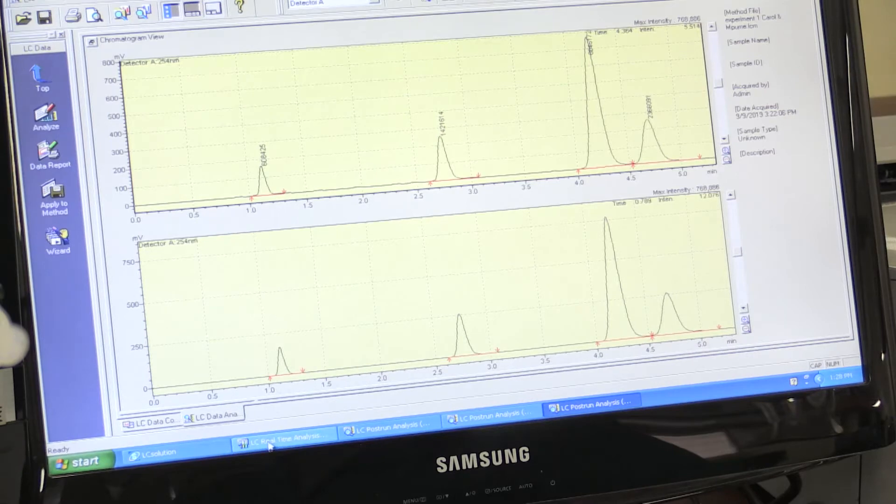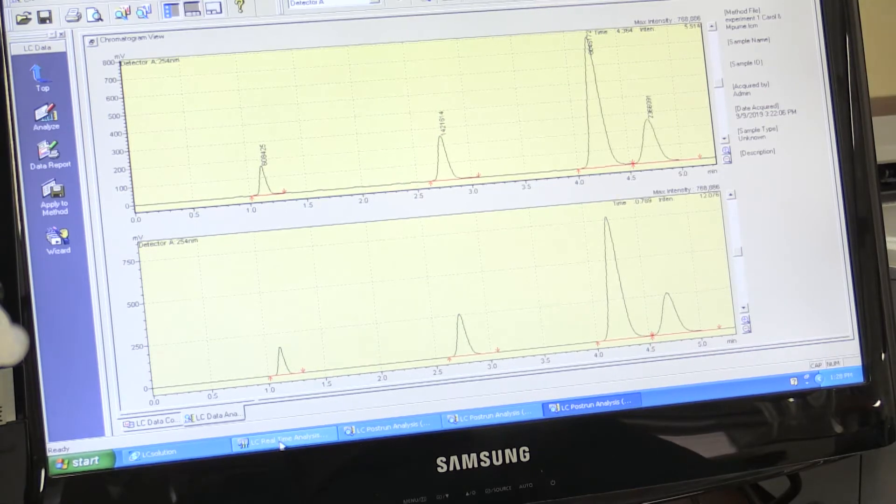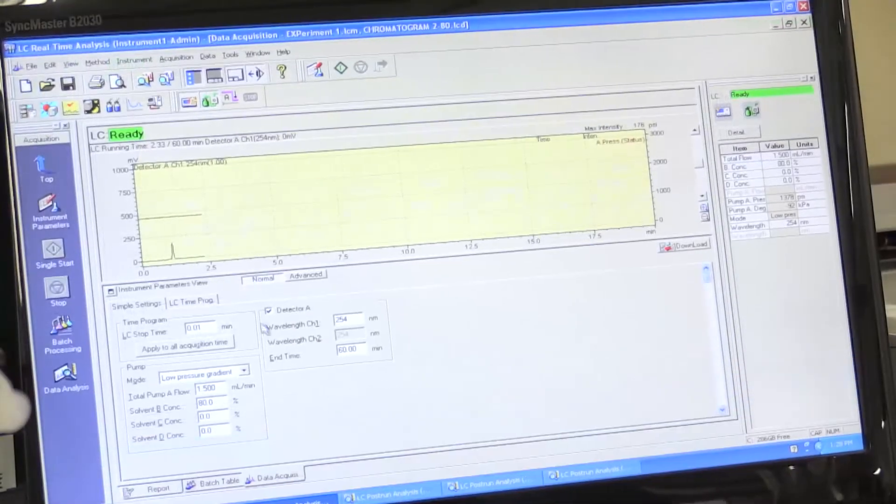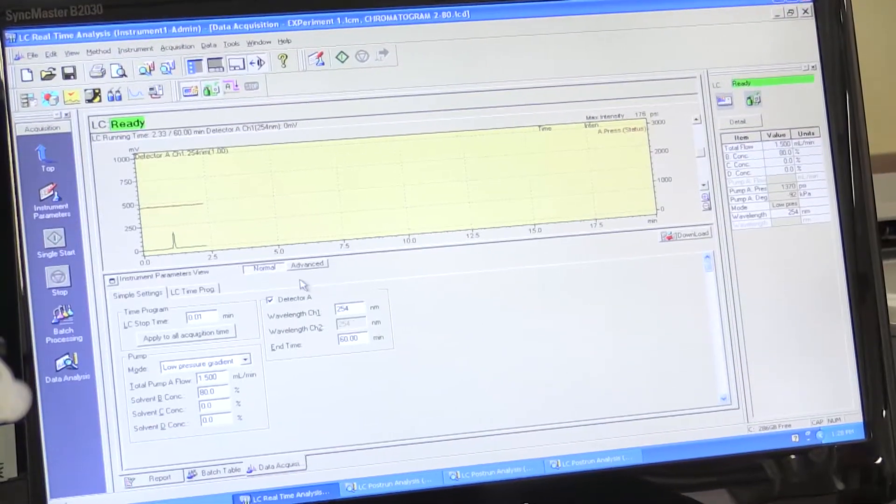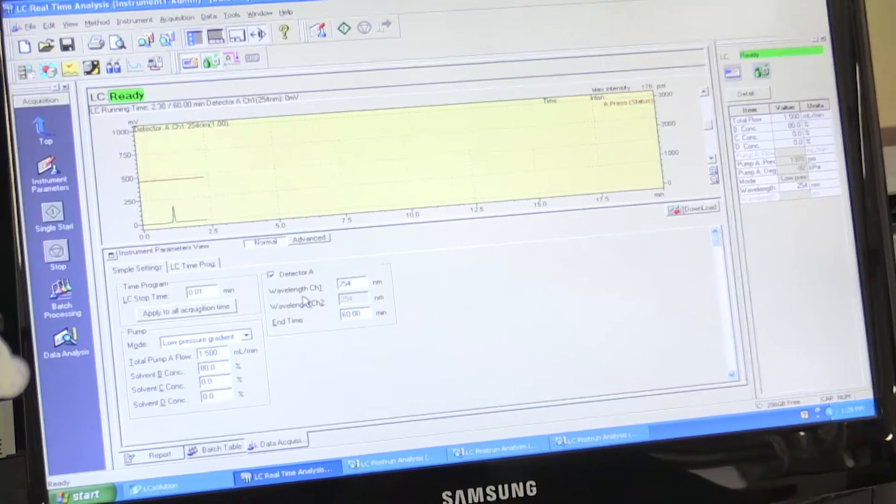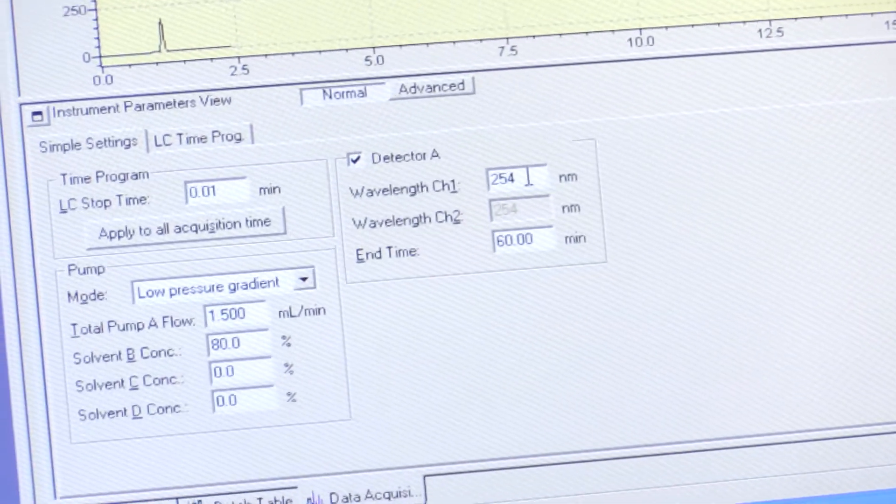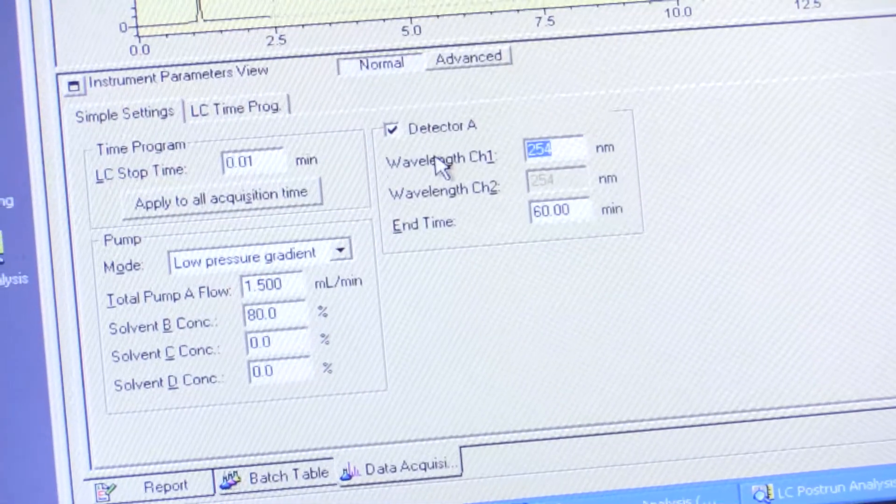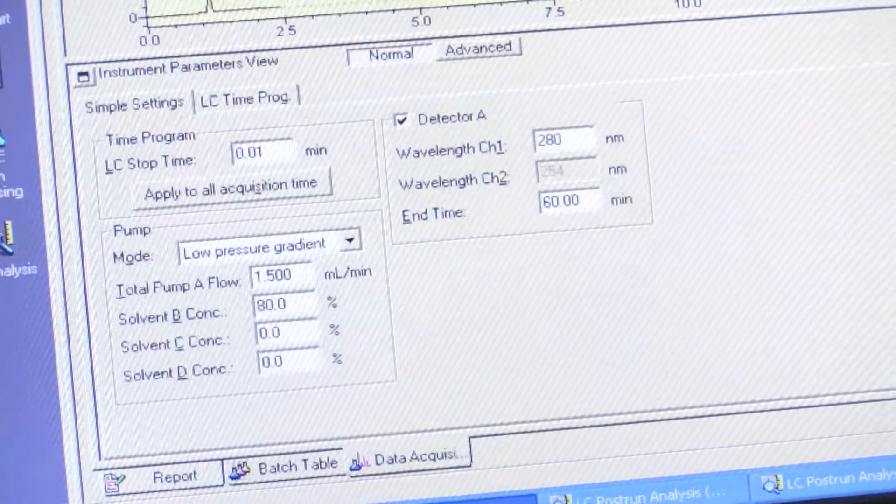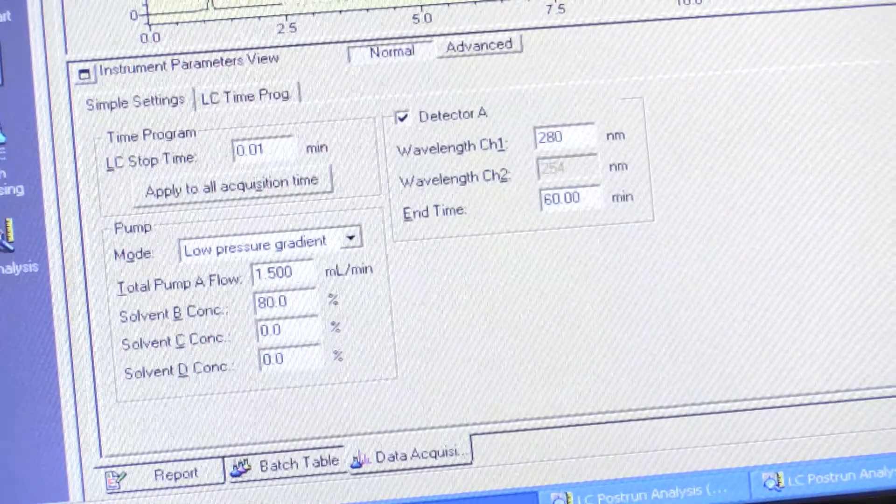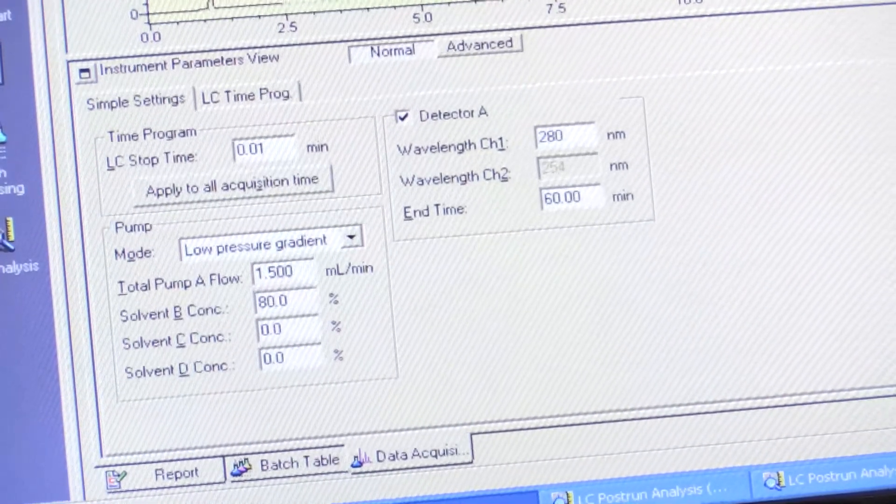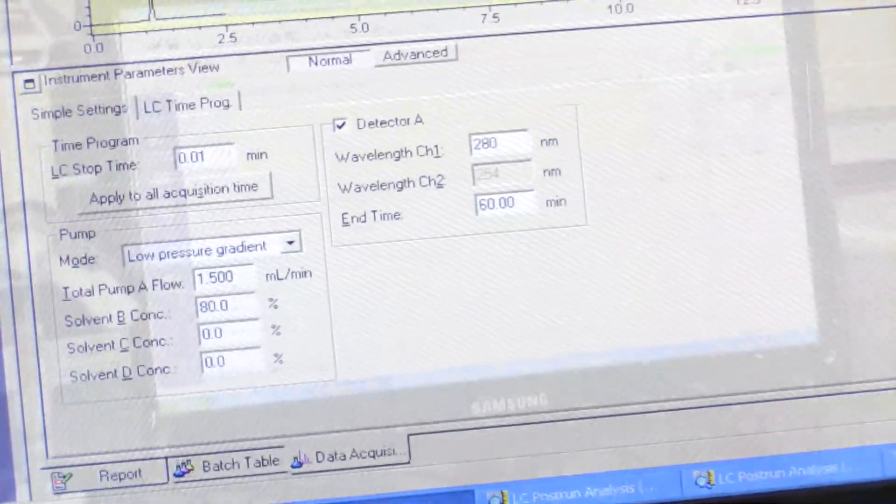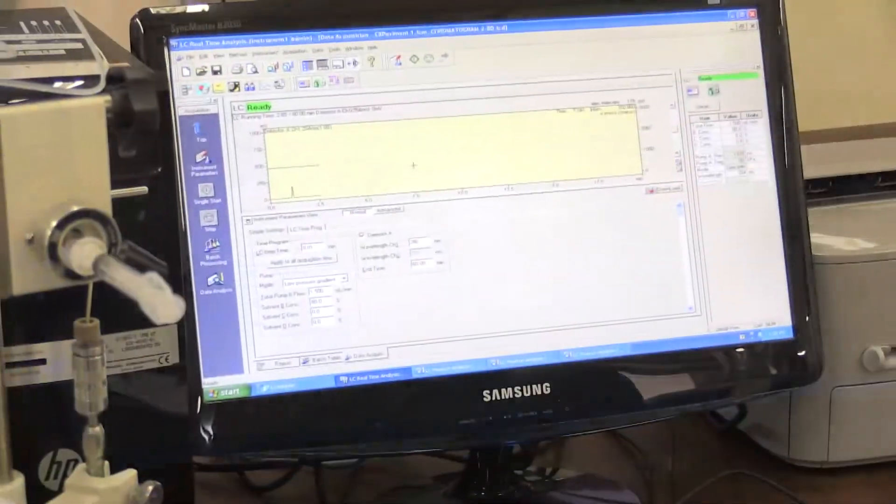Proceed to real-time analysis where it says detector A. We will change the detector wavelength to 280 nanometers. Press download to save the method.